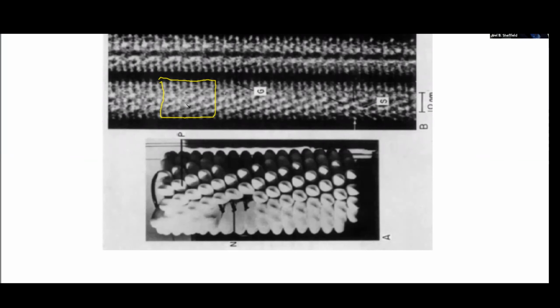But if I take this segment and then take a segment of it and then move it over and place it right on top of the next segment over and photographically merge those things together. That was the old days where you merged them photographically. Now you can do it digitally.